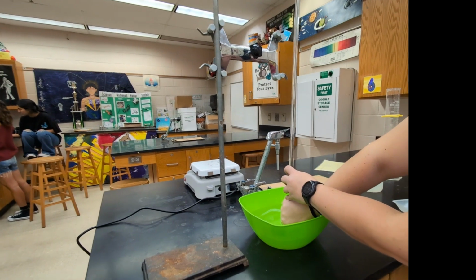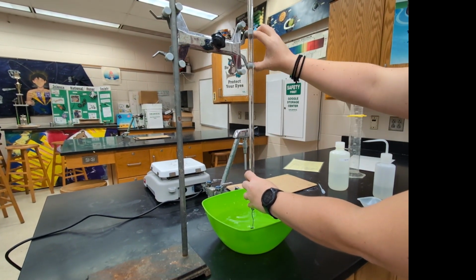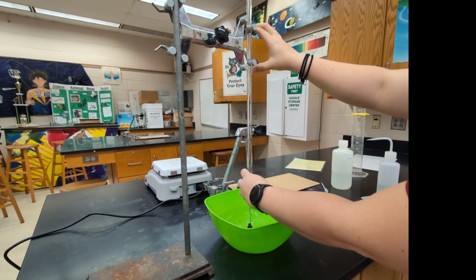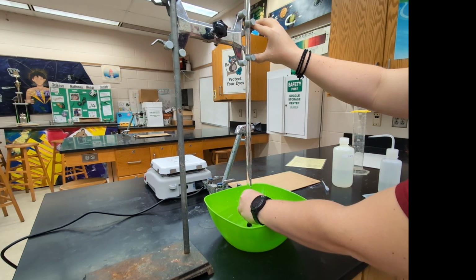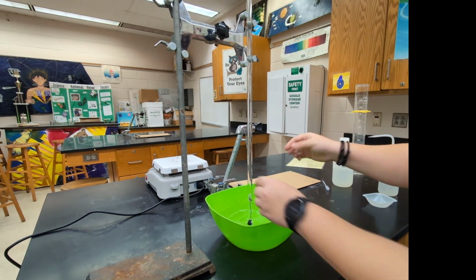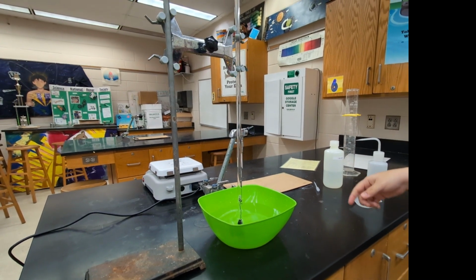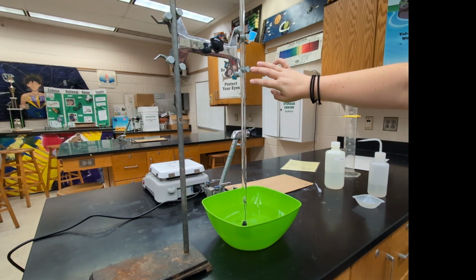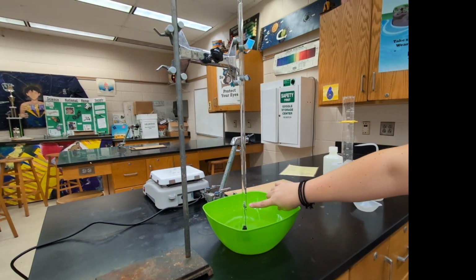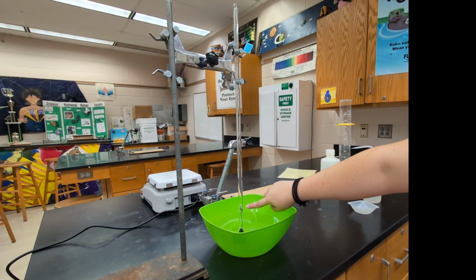And make sure it's completely submerged before you remove your thumb. And then you can secure it with the burette clamp. You want to make sure you leave just a little bit of space so that the water can still get in or out for the water displacement. And very slowly that acid is going to sink down, and you will start to see this bubble and form hydrogen gas as the acid meets the magnesium.